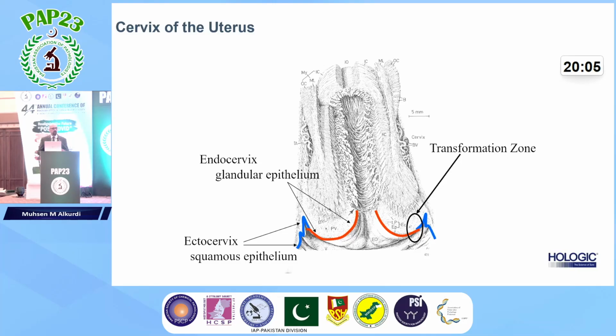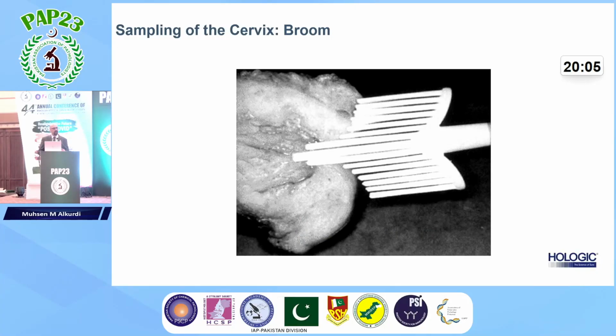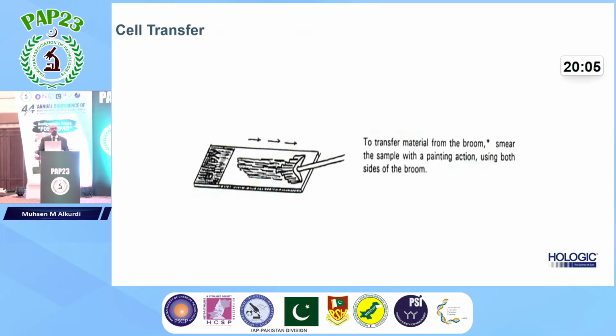Talking about the cervix, this is the major application of cytology science itself. The majority of the samples we get in cytology are for cervical cancer, or what we call gynecological cancer. We just need to ensure that we are collecting the sample properly to release a proper report. In the laboratory, we have no patient, so we need to ensure that whoever is dealing with the patient collects the sample properly and sufficiently in order to give the proper diagnosis.